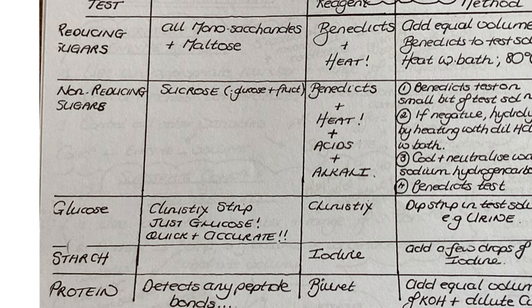So the next test I'm going to talk about then is the non-reducing sugar test. Now the most common non-reducing sugar that you will hear about is sucrose. Now if you carry out the Benedict's test on sucrose, the Benedict's will remain blue. But sucrose is a disaccharide. It is made up of glucose and fructose. So if the sucrose is hydrolyzed, it turns into glucose and fructose. And if you then add Benedict's and heat, you will get a brick red precipitate.